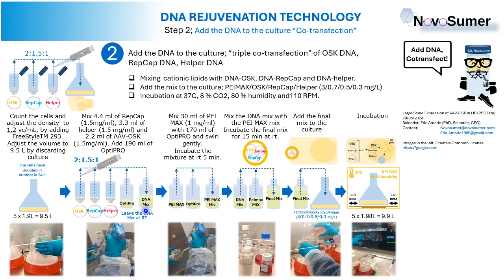Here you see the DNA mix. Here you see the PEI Max mix. We mix both together, as you can see in this step, in a bottle.